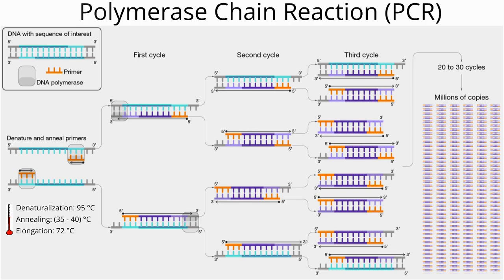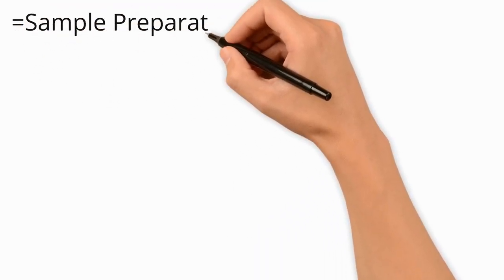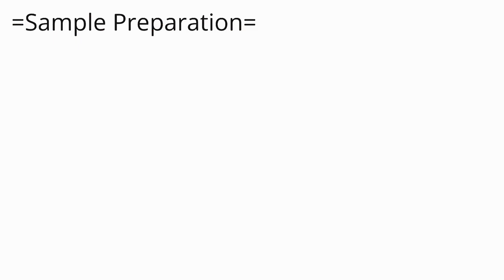So this amplification eliminates the need for extraction of a large amount of pure DNA for molecular studies. A key requirement for the application of the DNA in a PCR is the availability of effective DNA polymerase enzymes. For most PCR detection applications, a previous DNA purification step is required, especially when complex matrices such as food, water, or clinical samples have to be analyzed.